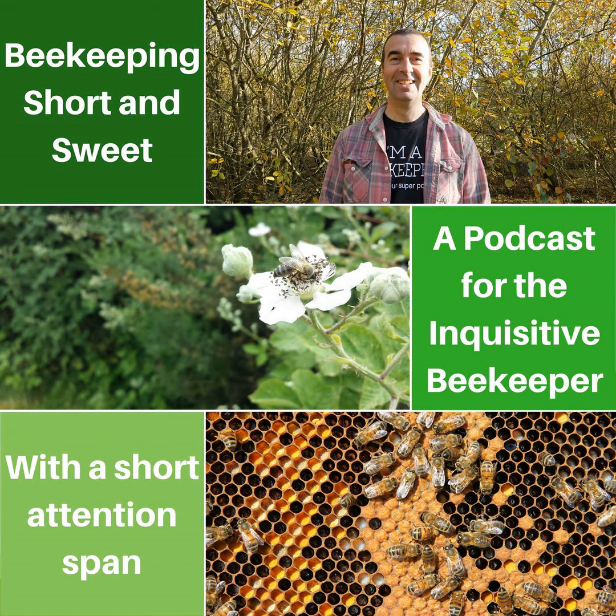An entry level low power microscope for less than £100, and an entry level high powered microscope for just over £100. And for a lot of beekeepers, I think, I'm biased because I have an enthusiasm for the microscopy aspect of beekeeping, but for a lot of beekeepers, that's really only the cost of an additional hive, and it can play a huge part in disease identification. For one thing, as you say, nosema is one of those areas that beekeepers like to be able to check for, and it can help with improving the health of their colonies. So I think for that kind of money, that's actually quite affordable.